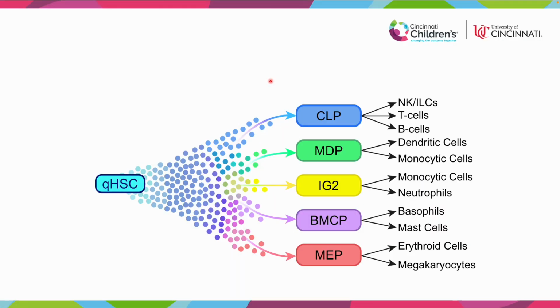First, let me give some background on the biological system we're studying. The goal of our project was to study the cells of the murine hematopoietic system as they differentiate into specific progenitors. We sampled the KIT-positive selected cells from the mouse bone marrow. It is important to note, however, that this kind of gene regulatory analysis can be adapted to practically any biological system to study mechanisms of gene regulation and cell function.